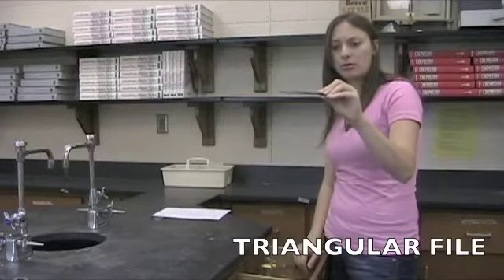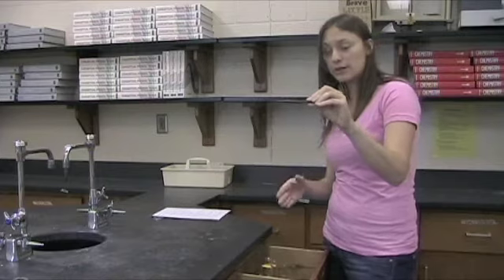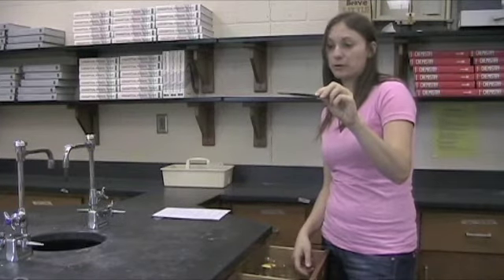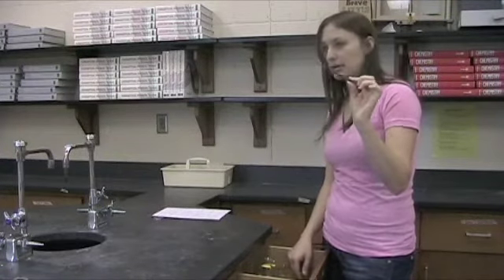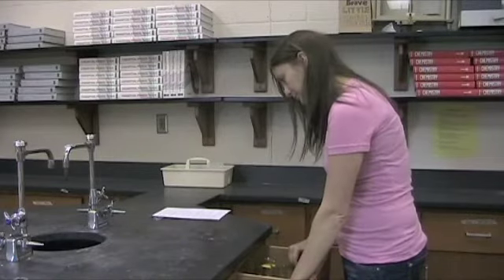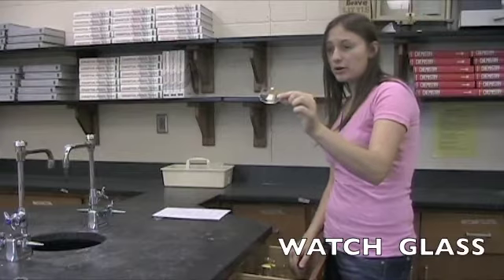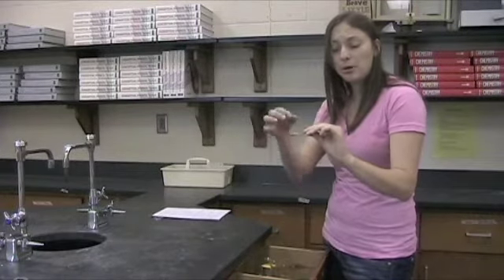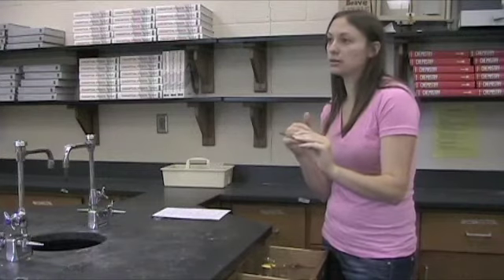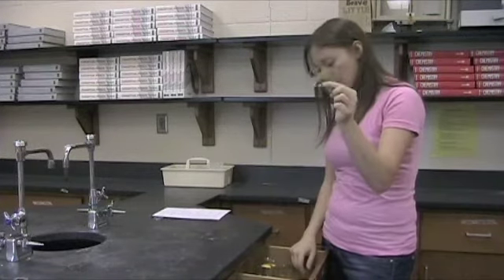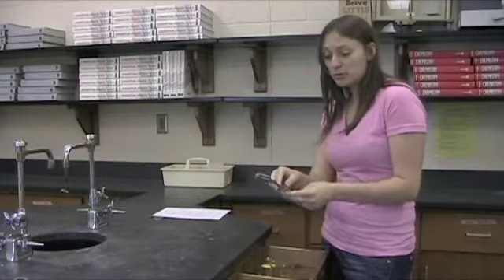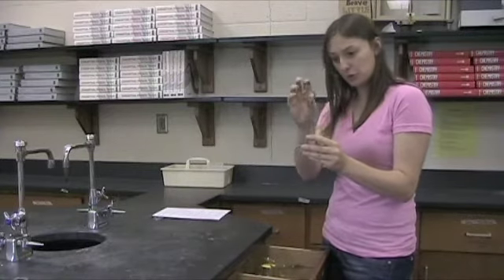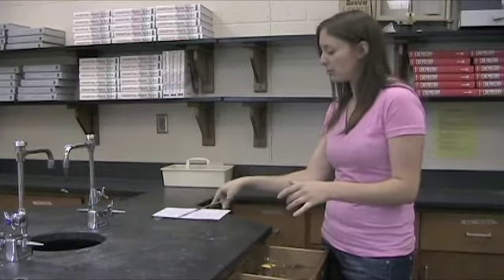I have a triangle file which is used to help cut glass or put little scratch marks in glass. So for us, we're going to use it for cutting pieces of pennies later on in the year. So a triangle file. Kind of like a big nail file. You also have a watch glass. These are used sometimes when I heat something up. I'll put a little bit on the watch glass. Sometimes if you want to just hold something for a while, there are watch glasses here. And we also have crucible tongs which are very useful to hold crucibles. That's why they have a little in the middle there that will fit an actual crucible. Or I'm going to use them to just pick up things and move them around. They are very handy. You will also have matches in your drawer.